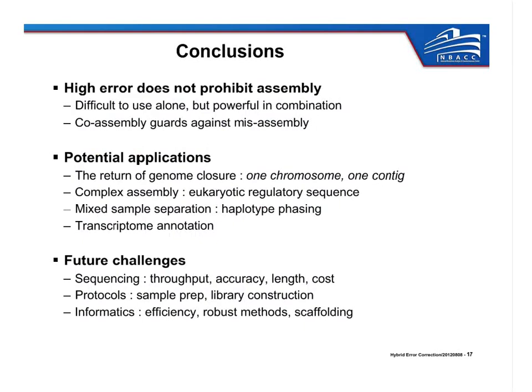And one other application that we didn't cover today, but we cover in the paper, is transcriptome annotation. Since these PacBio reads are longer than the typical transcript length, you can actually get the entire transcript and the entire variant of the transcript in a single sequence. And so you don't have to do any kind of assembly to get the full transcript.